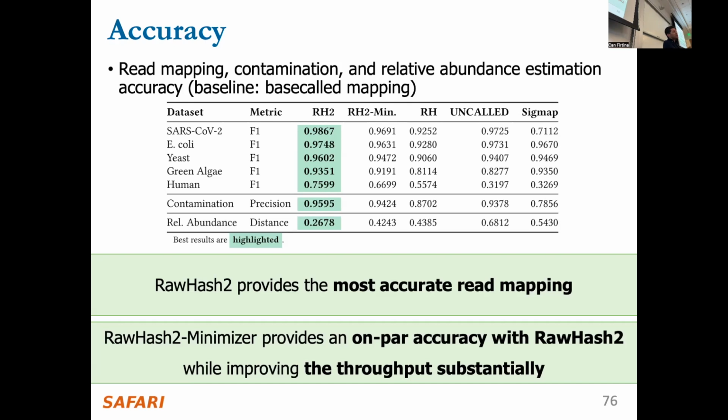That's true. Perhaps maybe fully using the long read information could be useful, although we're doing a chaining algorithm as well. It chains several seed matches in the large region still. But still, I guess there's a high chance. That's true, I agree. You have the information to resolve a lot of that. Exactly, I completely agree. We definitely have the information. The question is the redundancy. I got you. It's not an easy problem.